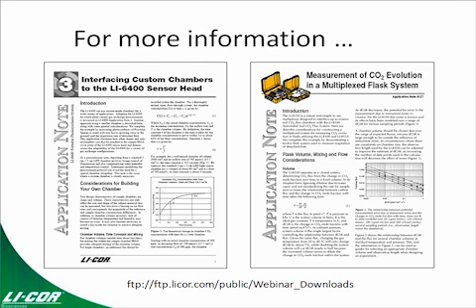Very good, Pat. Shall we move on to the next question? Absolutely. All right, thank you. Our last question is, how do I interface my chamber with the instrument?